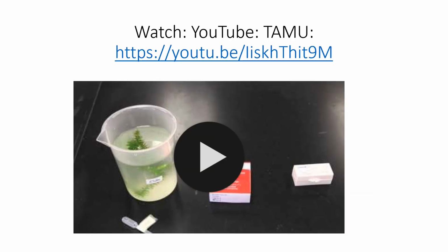This video gives you a good set of instructions on how to properly make a wet mount slide. So go and watch it. The link for this video is also available in the protocol for Lab 3B.